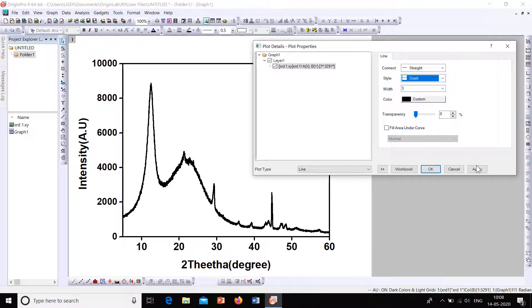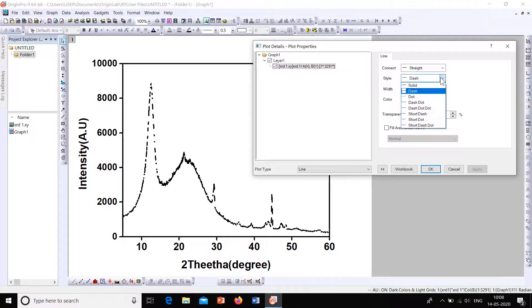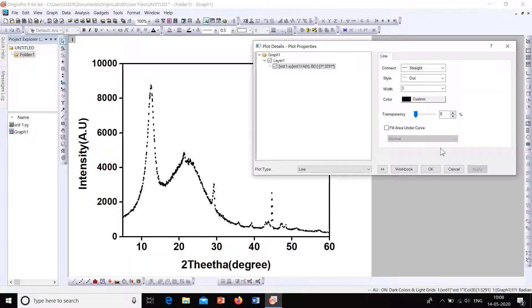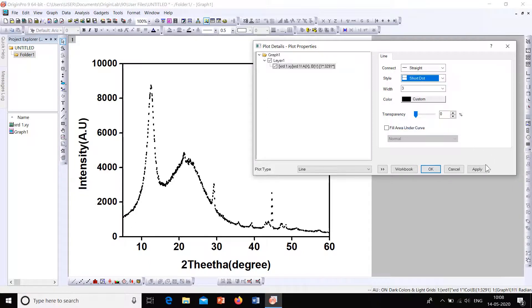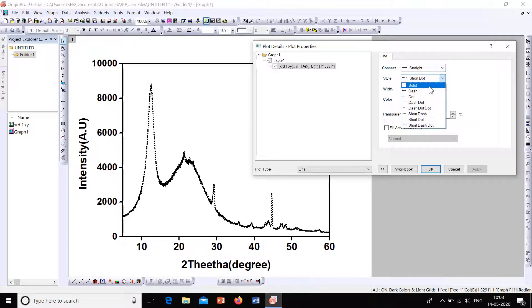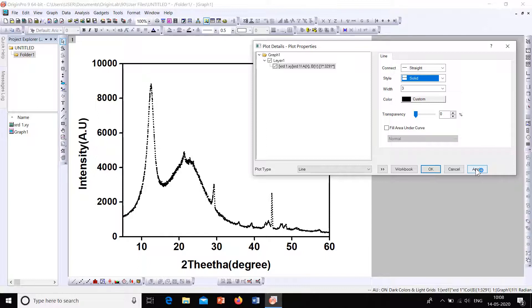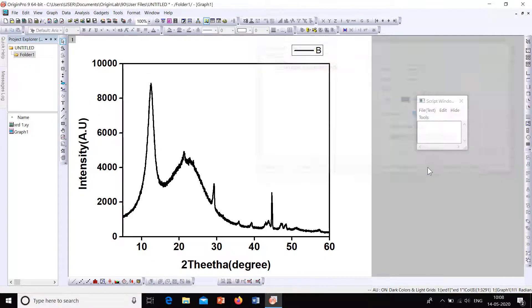You can also change the line style of the XRD plot. You can use dots, dashes, dash-dot, dash-dot-dot, or short dots — there are many options to try. Select solid for the final result. Click Apply and then OK. The XRD plot now looks good.